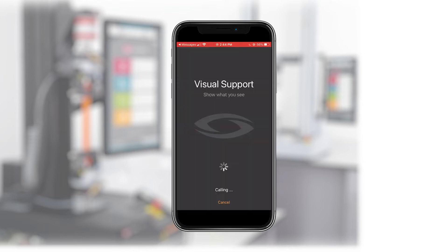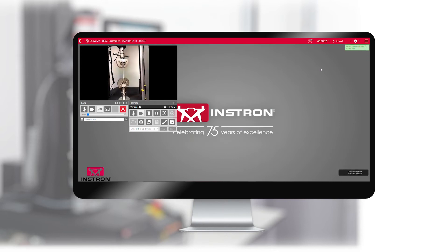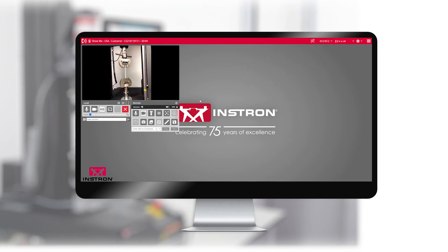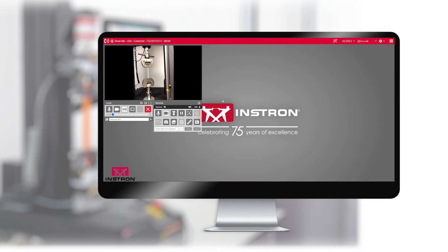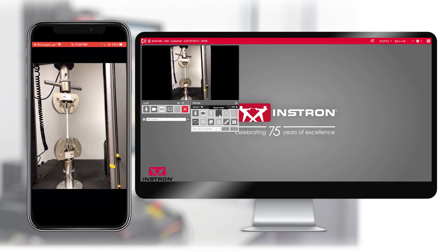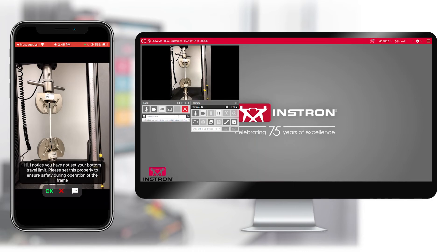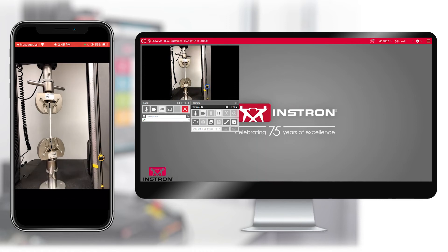The customer uses the camera on their mobile device to show technical support a view of their new test setup on their Instron system. Technical support notices immediately that the customer has not set their lower travel limit properly and pauses the on-screen image in the call. The customer's lab is quite loud, so the chat feature is used rather than direct microphone audio. Using the chat feature, technical support messages the customer to indicate the issue and then uses the drawing tool to circle the travel limit that is not set correctly.